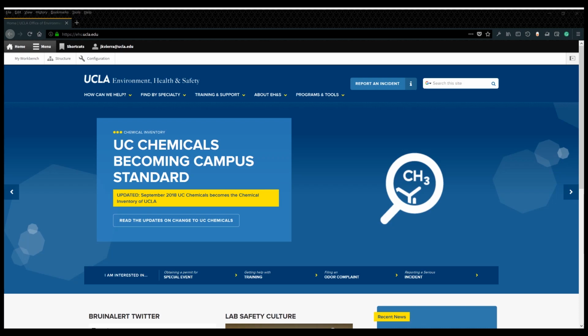Today I'm going to be going over how to access profiles, add a group, and add a location for principal investigators. If you are a lab member, you will have to request from your PI to be added to their lab group. So let's begin.